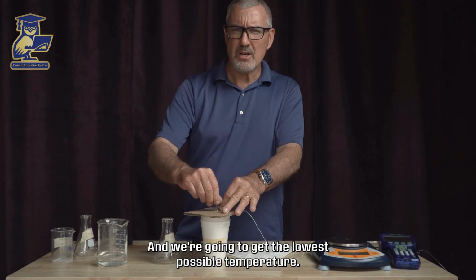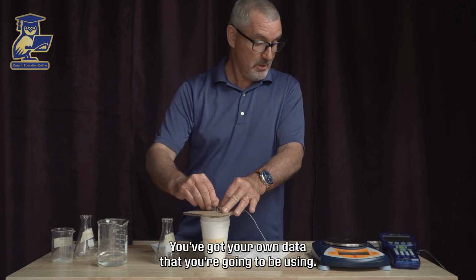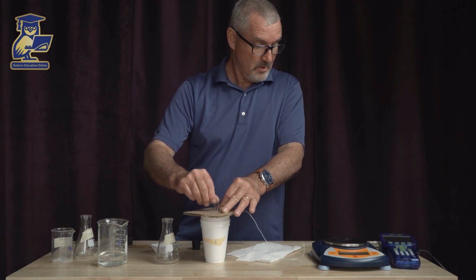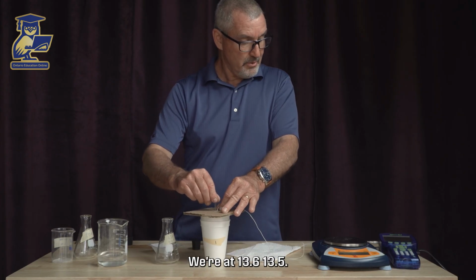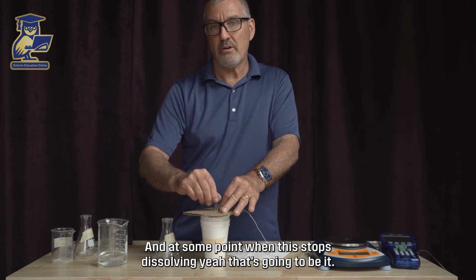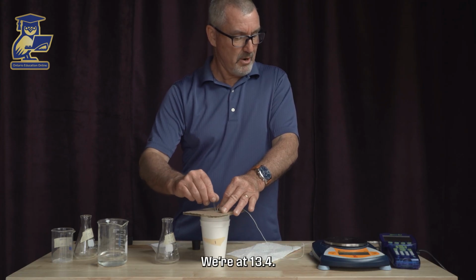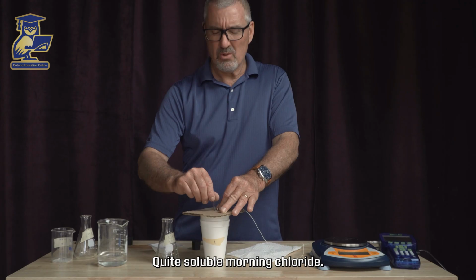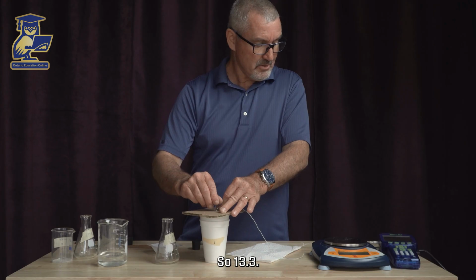And we're going to get the lowest possible temperature, all right? Again, you're not using this, you're using your data, all right? You've got your own data that you're going to be using. That's unlike anyone else. So we're down inside 14 degrees, we're at 13.6, 13.5, and at some point when this stops dissolving, that's going to be it. I think we're almost there, we're at 13.4. Quite soluble, ammonium chloride. It's a very soluble chemical. And I think we're at the end there, so 13.3.